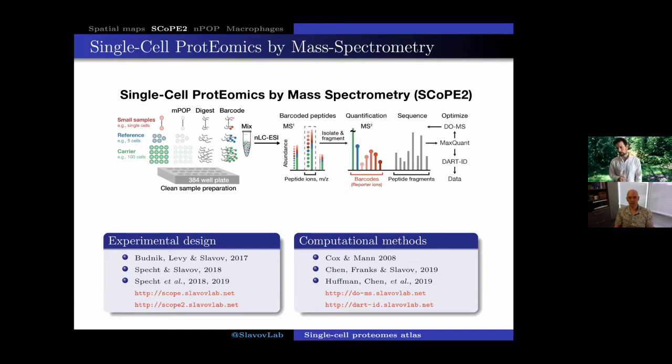We like to use computational frameworks to optimize our parameters for data acquisition. We found those to be incredibly useful because before we started using them, I was spending a large fraction of my time analyzing failed experiments and trying to figure out what went wrong. Then we simply wrapped up all of the simple debugging capabilities that we were using into a data-driven optimization for mass spectrometry Shiny app that is freely available for everybody to use. It's useful not just for optimizing ultra-sensitive analysis, but can be used for any type of mass spectrometry optimization. At least we find it useful.